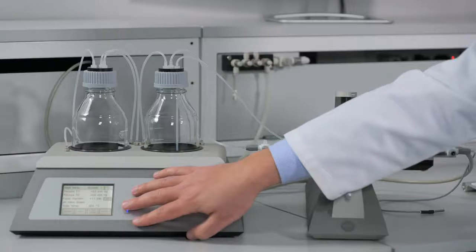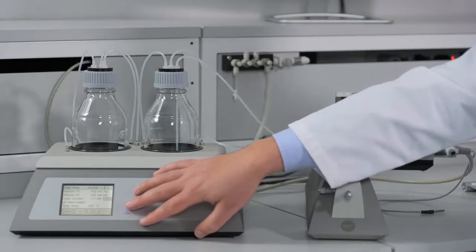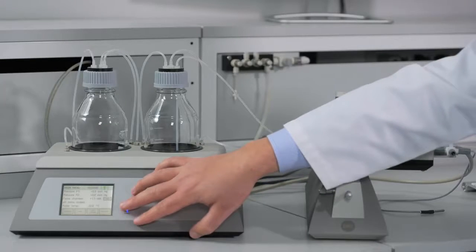You'll see on the front there is a touchscreen that you can use to control settings about the system. However, you can make those same changes through the MyoView software far quicker and easier.